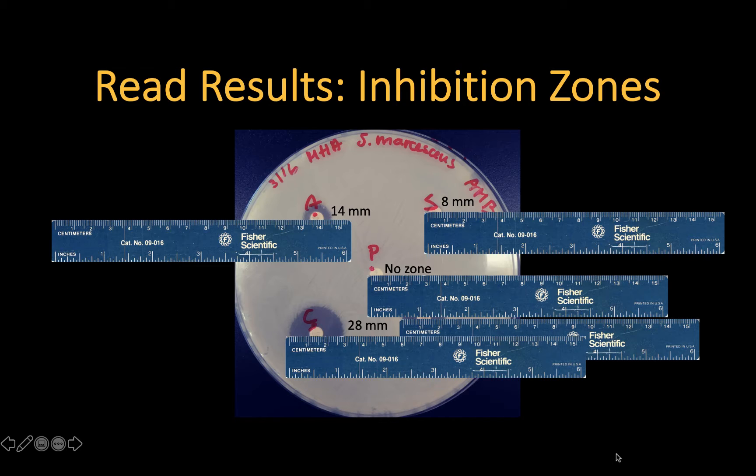Apparently the bacteria can grow in the presence of penicillin even at the highest concentration, right at the edge of the antibiotic disc.